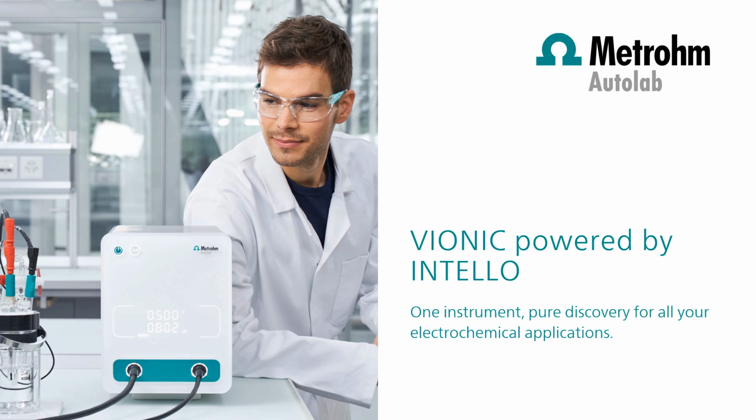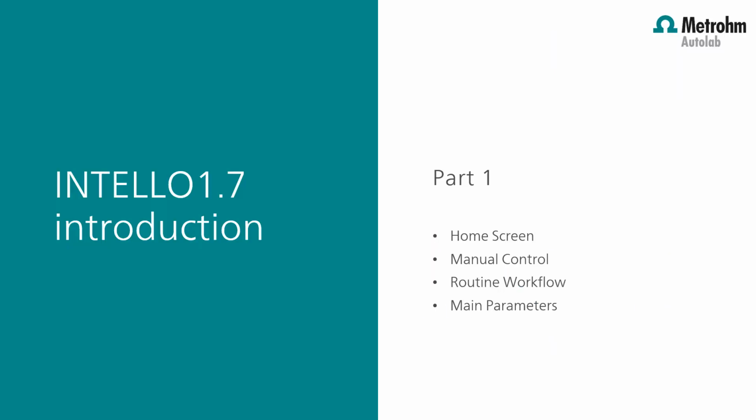Welcome to INTELLO videos. This video provides a general introduction to the new INTELLO 1.7 software. The INTELLO introduction is divided into 5 separate videos. For best understanding, these videos should be viewed in order. The first part will introduce the home screen, the manual control, routine workflow, and the main parameters.